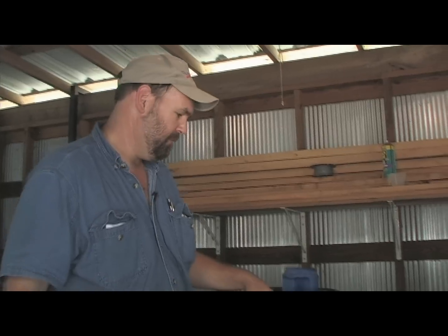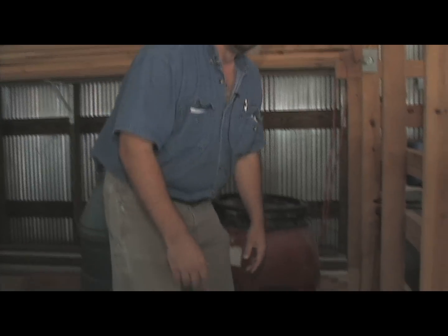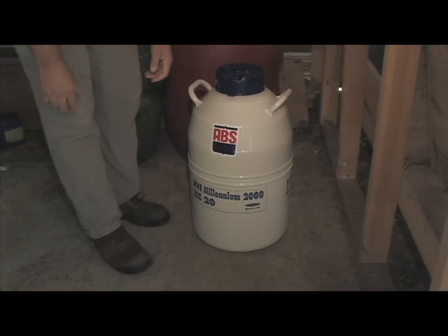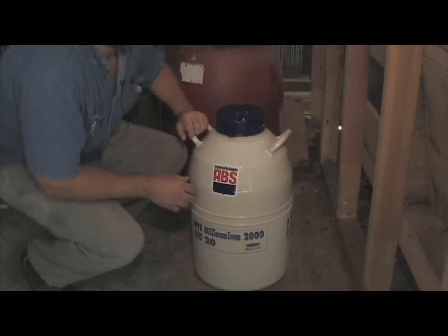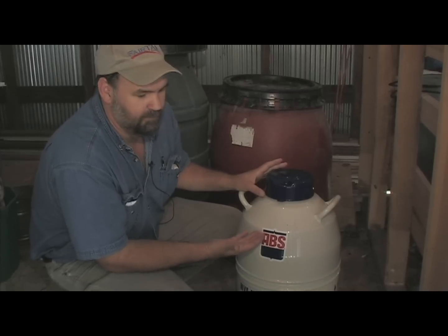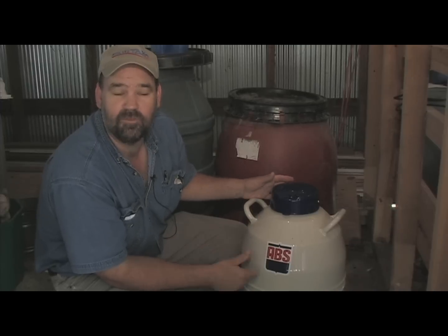First off, you've got to have a tank. ABS is the company — absglobal.com. I don't work for them or anything, but they're the ones that helped me get all this together. The tank will hold a lot more semen than I'll ever need — it'll hold hundreds of straws. I just put about 20 in it, but you need a larger tank because it holds a lot more liquid nitrogen. This tank will last about three or four months. He comes out to fill it up on a schedule — I'm on his calendar — he'll just fill it up and send me a bill. The bigger your tank, the less frequently you have to get it refilled.